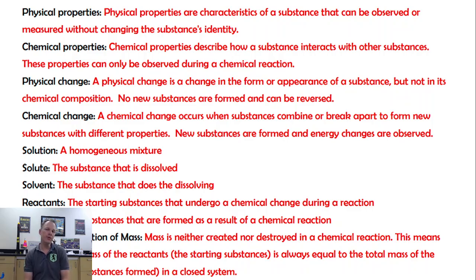So then what's a chemical property? Well, a chemical property is, let's pour some chemicals on this thing and see if there's a reaction. And you can't determine the chemical properties of something unless you mix it with other substances and see how it interacts. Can I tell just by looking at this copper, oh, I think if I put it in silver nitrate solution, there'd be a reaction? Can I tell that?